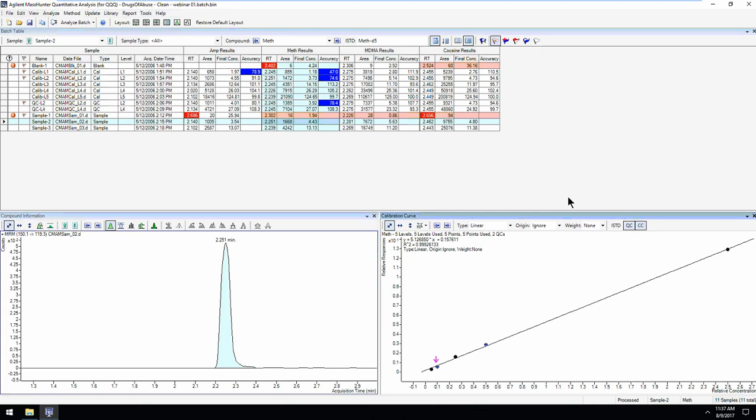Last week we talked about the outlier custom calculation. To go into that, you would need to write a little script that would do the custom calculation. The other option for doing custom calculations is to export the batch table into an Excel spreadsheet and then set up some Excel macros to do that custom calculation within the Excel environment. So either one would work for us.